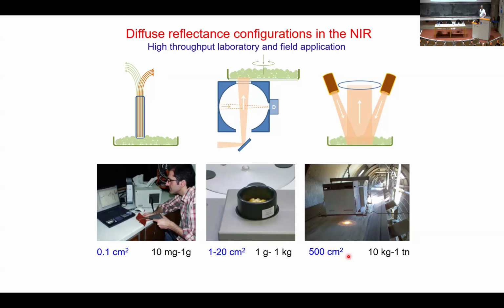Right. And in the following slides, you will see ways that we can study the first molecular layer of water in contact with clay in the presence of the next layers that start looking like liquid water, and they are not that interesting. I mean, I'm not interested in how much water this has. There are other techniques for that. You do a gravimetric technique and you're done. You decide where you want to stop, at 100 degrees or 200 degrees, but that's it.